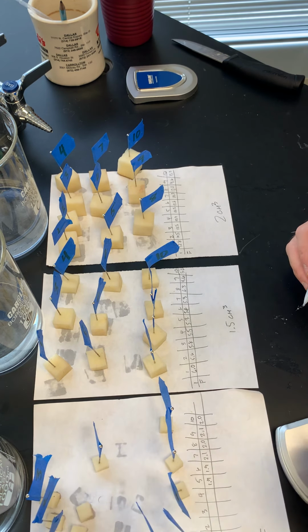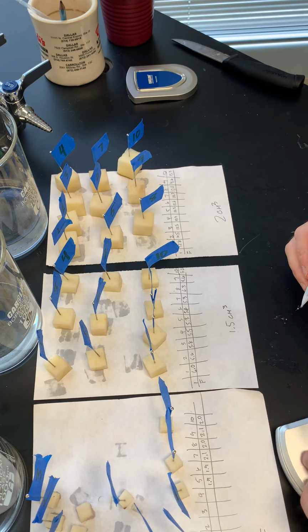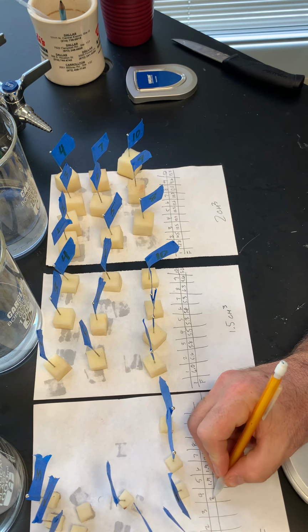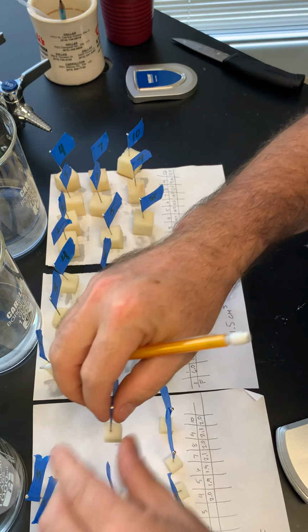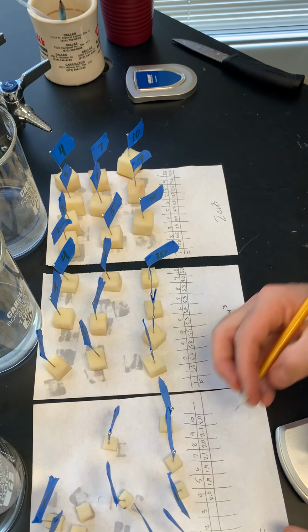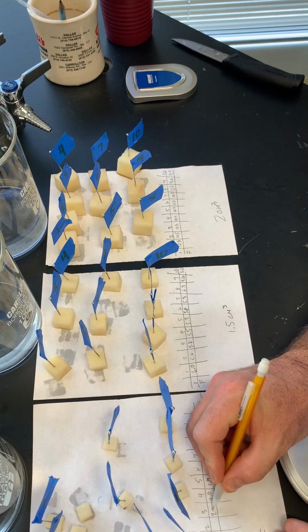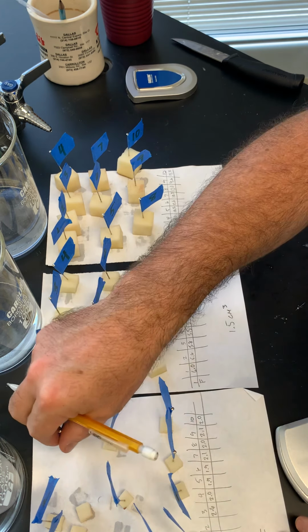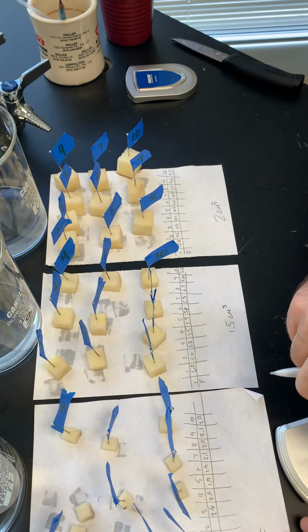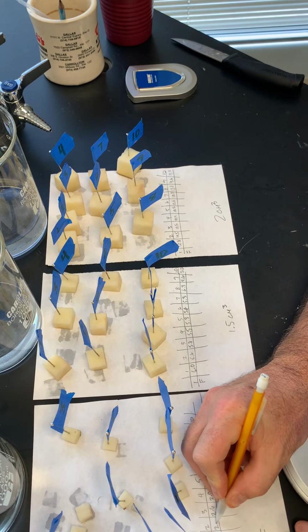let's see, there's my 4, come on buddy, you can stand up, 2 grams, 3, 2.6 grams, man, this guy's heavy, 2.1 grams for number 2.